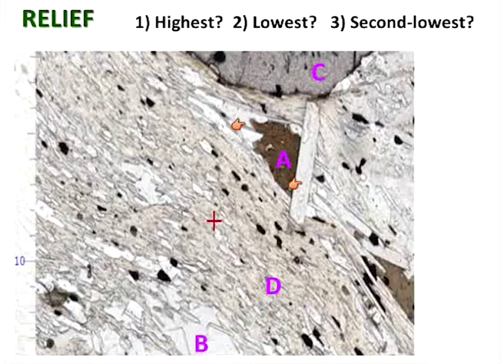Another reason for a blurred edge is possibly slightly like this garnet up here, I think. It may be that the mineral is slightly breaking down. You can sometimes have that sort of clear edge blurred just because it's altering to a very fine-grained aggregate of other minerals. Okay, let's move on.